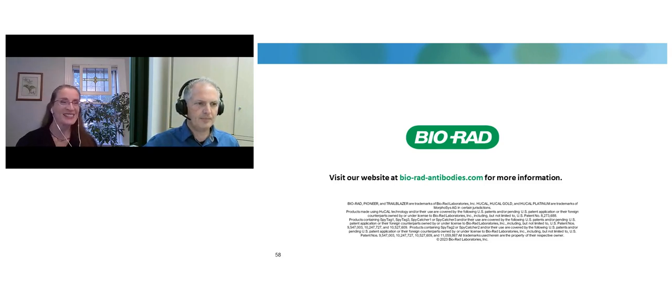Next question. Is there a particular trick to getting high affinity antibodies, which you were talking about when you were discussing the phage display? Yeah, so to get high affinity antibodies by phage display, there are basically several aspects which play a role. So first, it's a selection method. You want to have a selection method which works very efficiently, which has not many biases, like different growth of the E. coli during the amplification step.